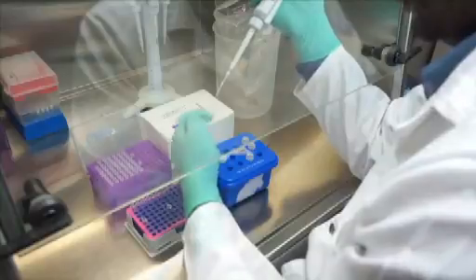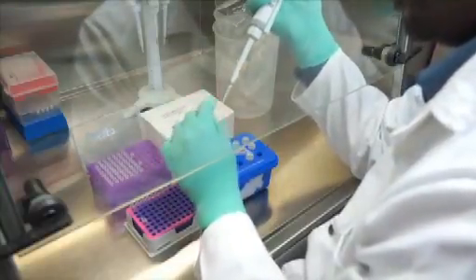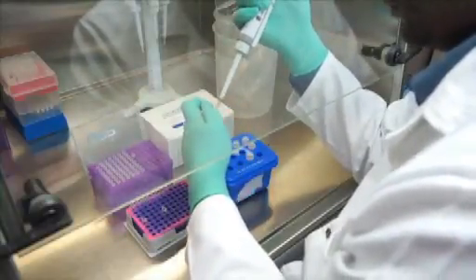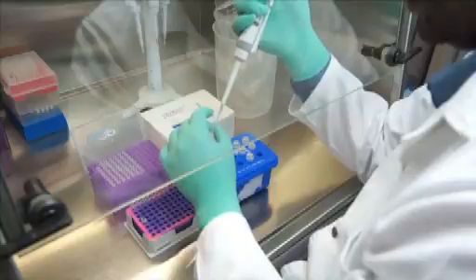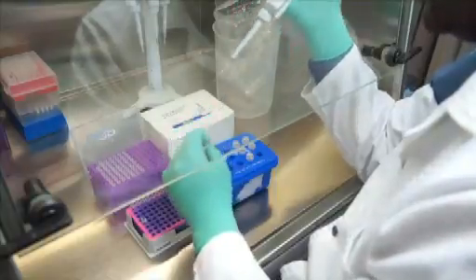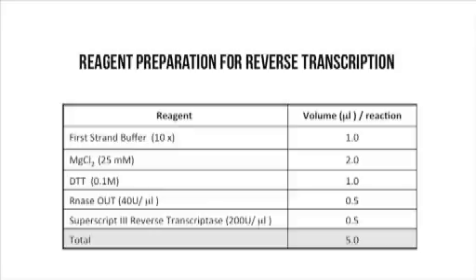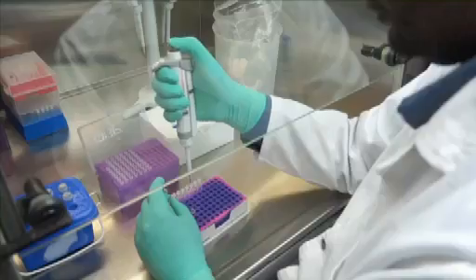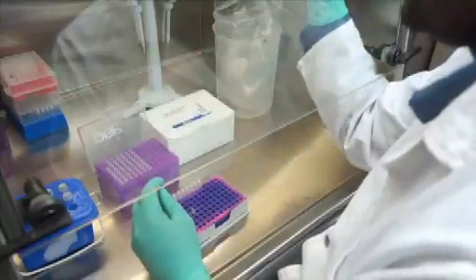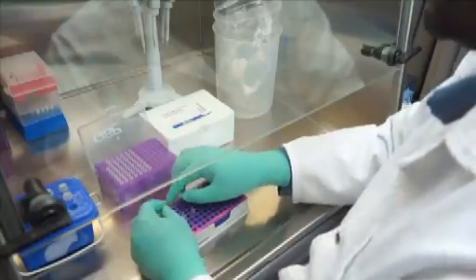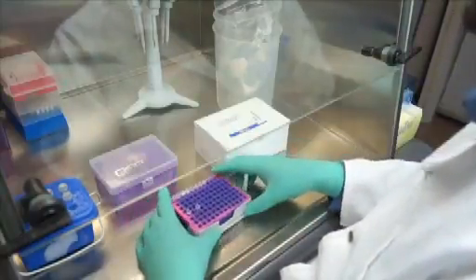Prepare RT enzyme mix by adding 1 microliter of the 10x buffer, 1 microliter of 0.1 molar DTT and 2 microliters of 25 millimolar magnesium chloride to a sterile tube. Add 0.5 microliters of each of the enzymes, RNase Out and Superscript 3 reverse transcriptase to the enzyme mix tube followed by a gentle mix. Keep the tubes with the DNTP primer mixes and enzyme mix on a cold block and move to the RNA station.